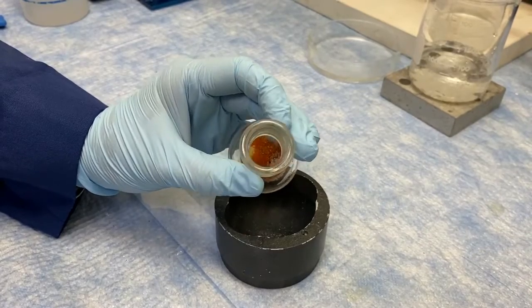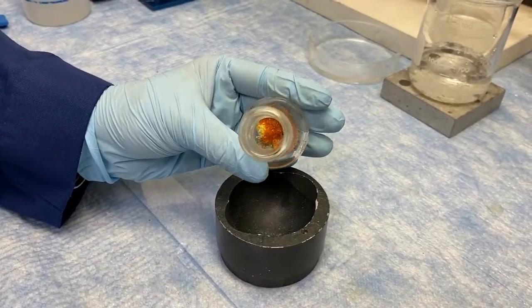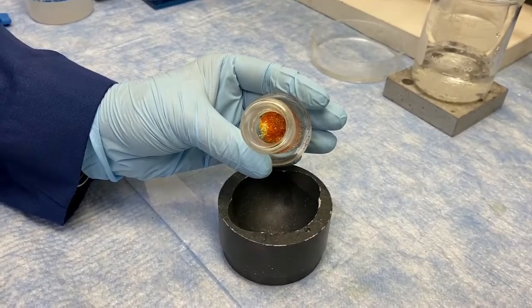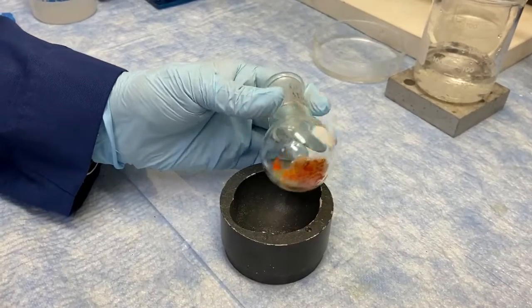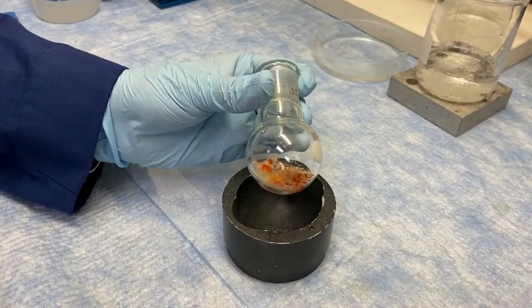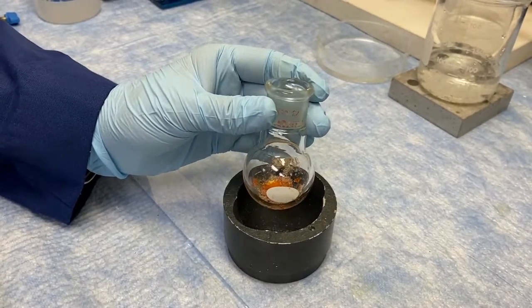The amine and the aldehyde have melting points that are very close to room temperature, right around 40 or 56 degrees. And so when we mix them together, we make an impure solid, and the resulting melting point of the mixture is lower. This allows us to do what is called a neat reaction.